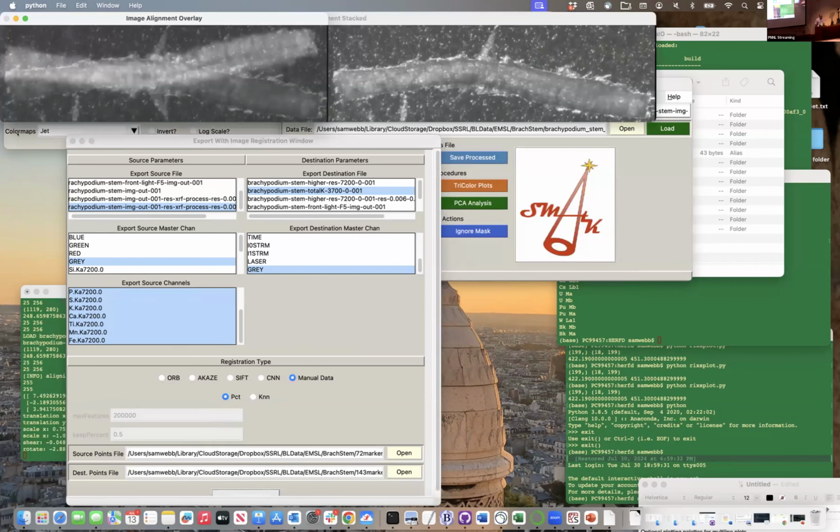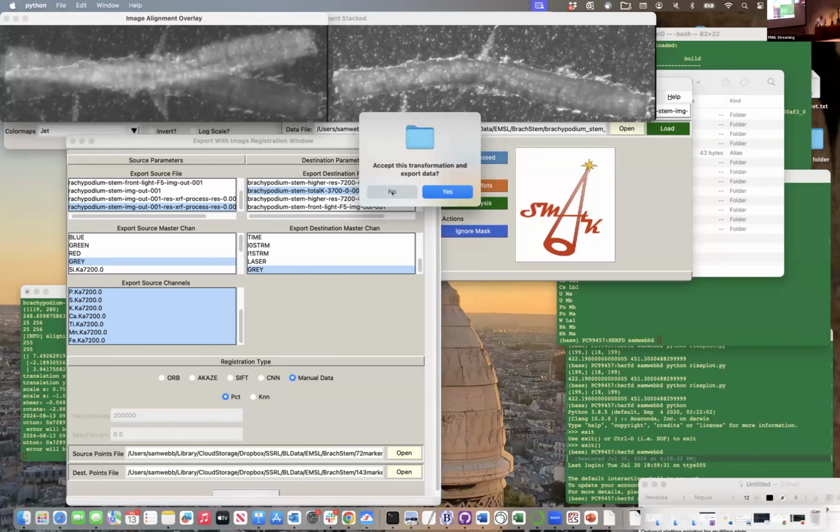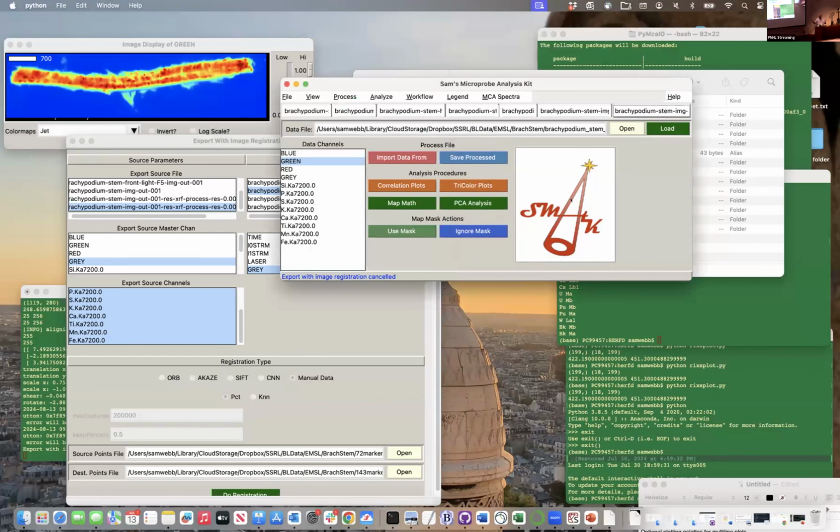Okay. Just when you think you had it, it doesn't work, right? So we're going to do one more thing. See, it's great when we show things that don't work. This is what's going to happen on most of your data, right? No, it is perfect. Don't worry. Don't worry.